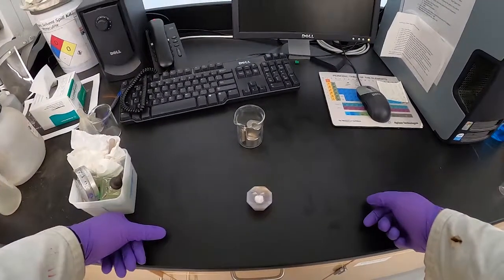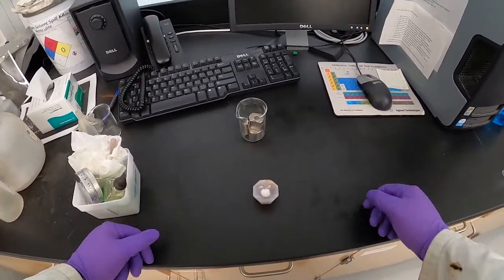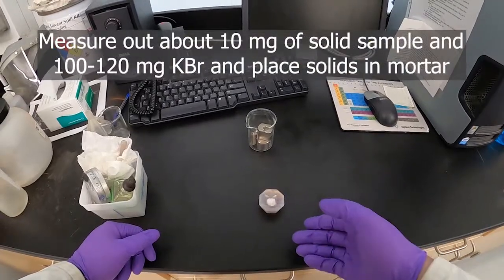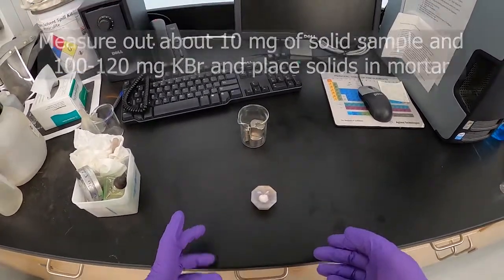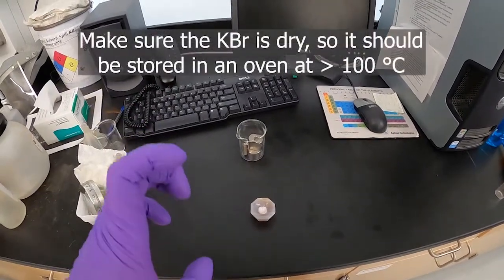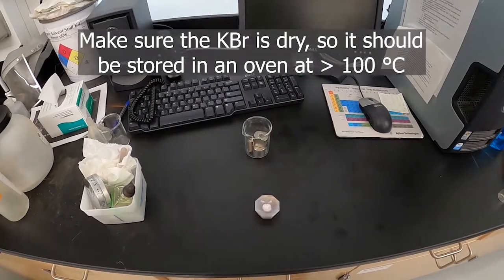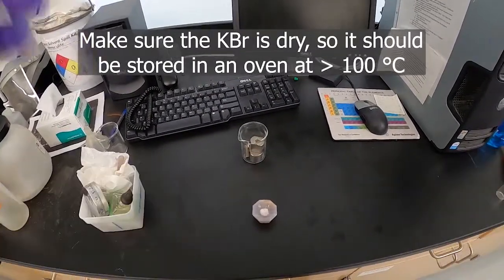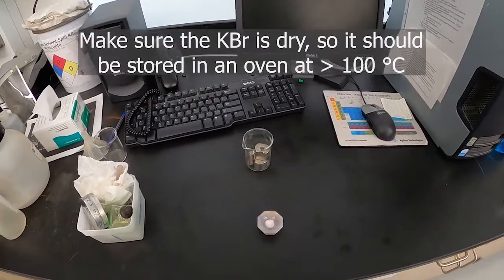I'll now demonstrate how to make a KBr pellet for IR spectroscopy. The first thing you need to do is weigh out about 10 milligrams of your sample and between 100 and 200 milligrams of potassium bromide. You want dry potassium bromide — it needs to be stored in either a desiccator or an oven so that it doesn't collect any water from the atmosphere and spoil your sample.